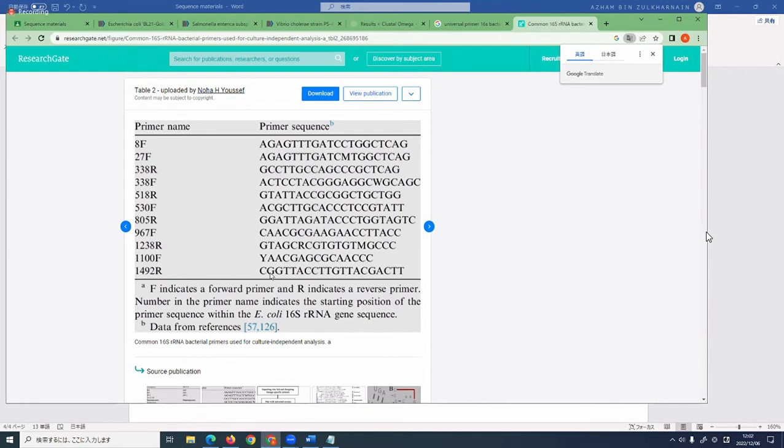The reverse side, and you can see, for example, at the location 1100, 1100F, this is SF, all right? There's a Y over here. So we know ATCG, supposed to be ATCG, but somehow it ends up as Y, and then there's an R, right? An R over here. So R is not the common base. So there's also an M, all right?